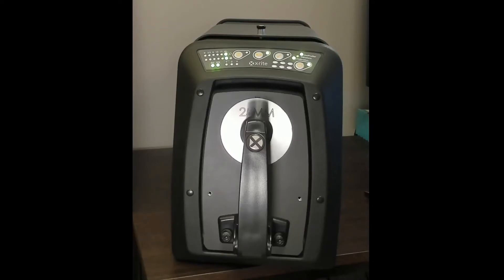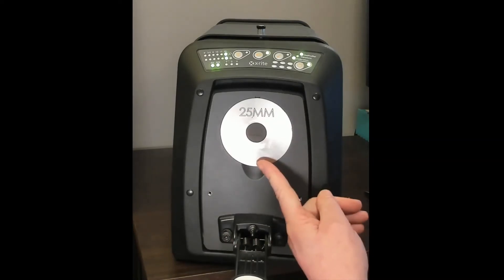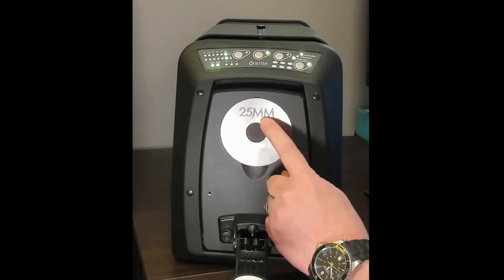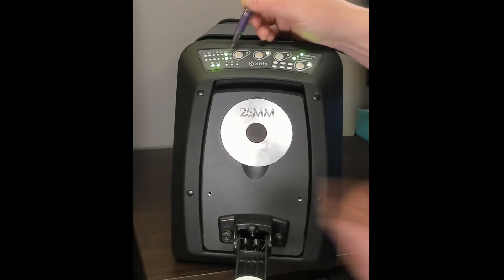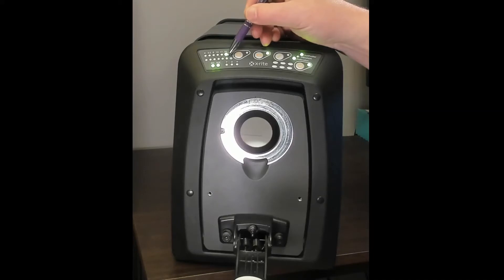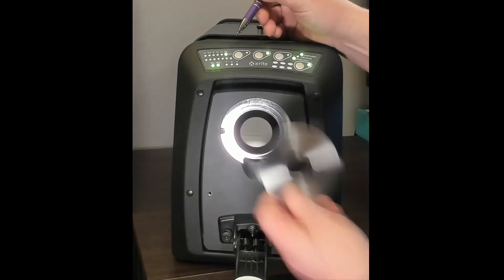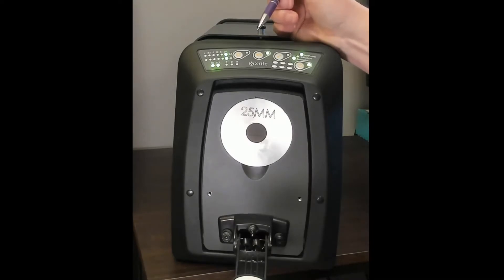Now let's take a look at my CI7800 instrument — you can see a front view of it sitting on my desk. If I pull the sample arm back, you'll see I've got a 25mm aperture plate in place. The aperture plate itself is labeled, and one of the indicator lights tells me I'm set to measure a 25mm spot with that plate in place. These plates are metal and magnetically attached. If I remove it, the light goes out — as soon as I put it back, the instrument automatically redetects which plate is in place.